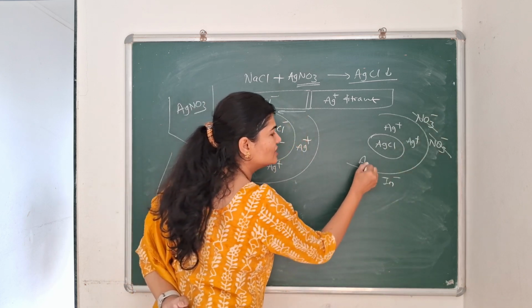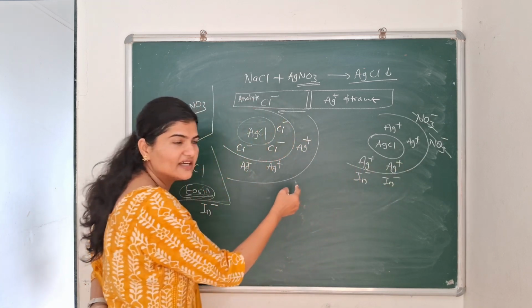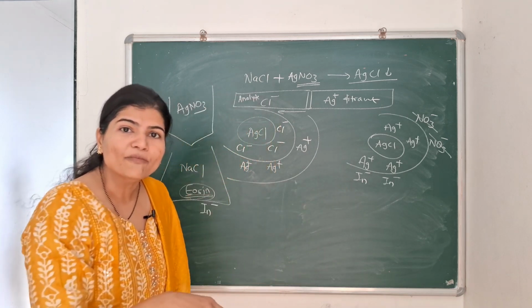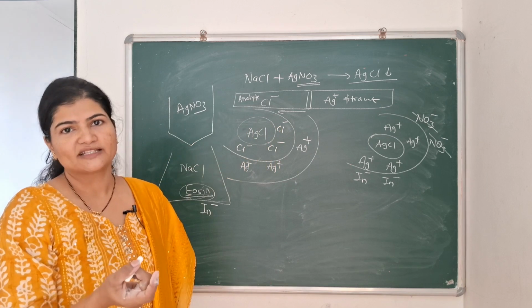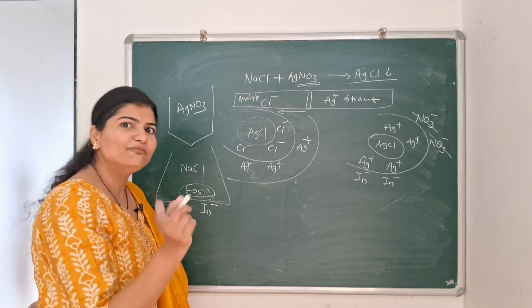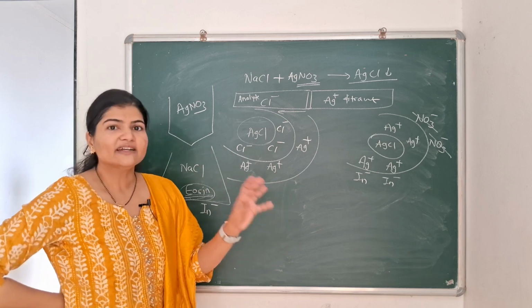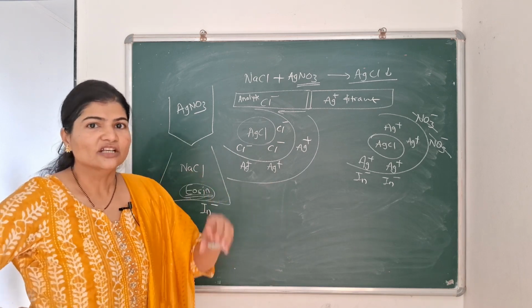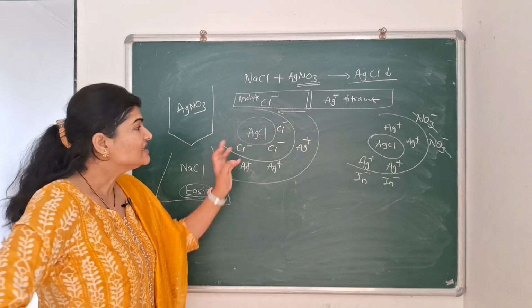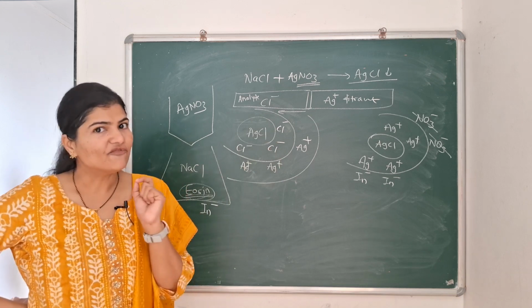Now once they come in contact with the silver ions, which were the primary adsorption layer, the silver ions and indicator ions form a pink colored complex. They give the precipitate the pink color, and that pink color indicates the completion of the reaction. So here we are taking into consideration the property of a colloidal precipitate to adsorb its own ions which are in excess.